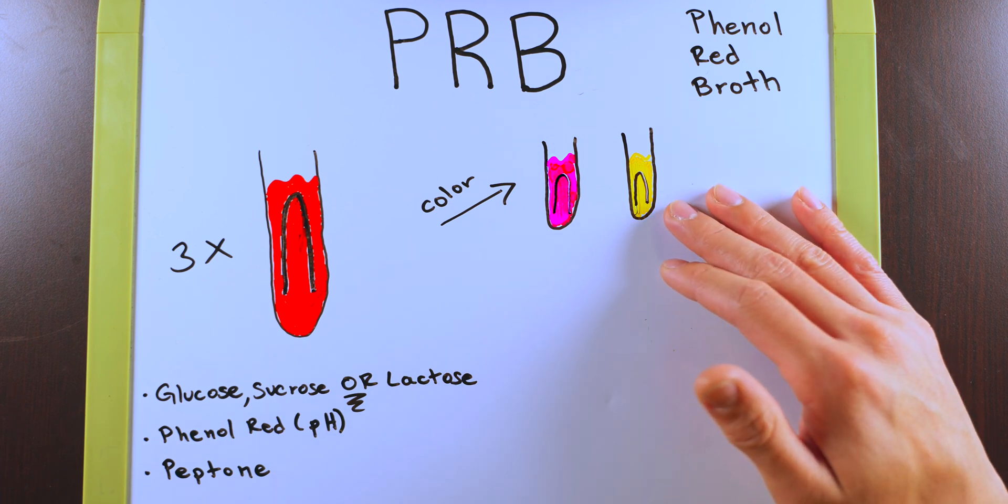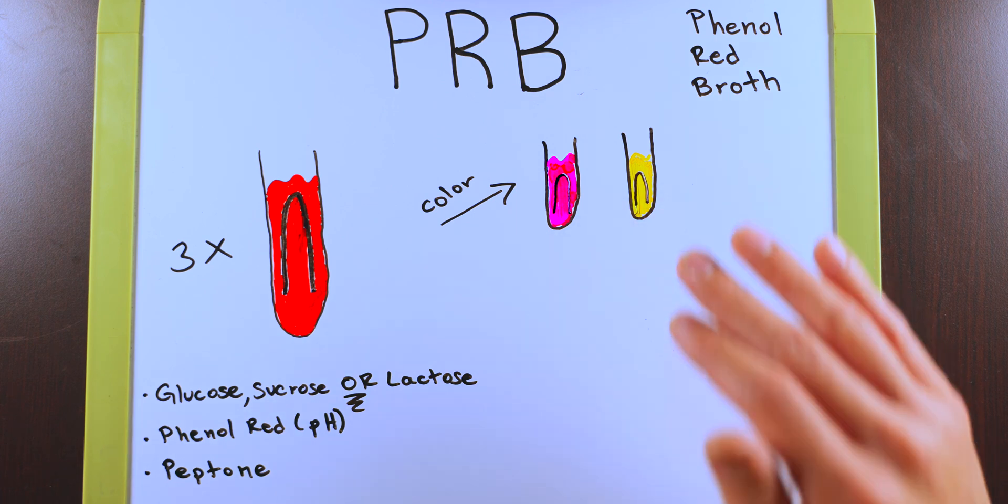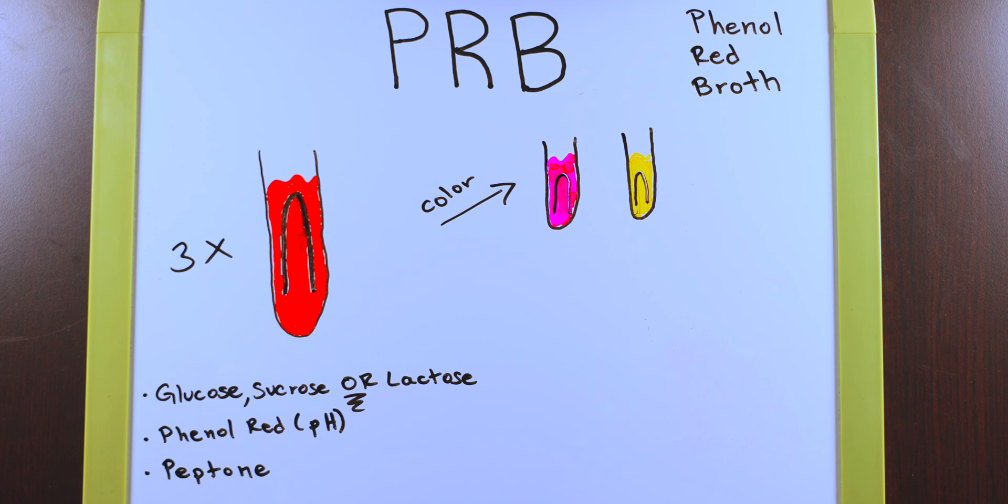However, if your test tube is yellow as we have over here, this indicates to us that the pH in the broth is now below or at 6.8, and this is consistent with acid end products.